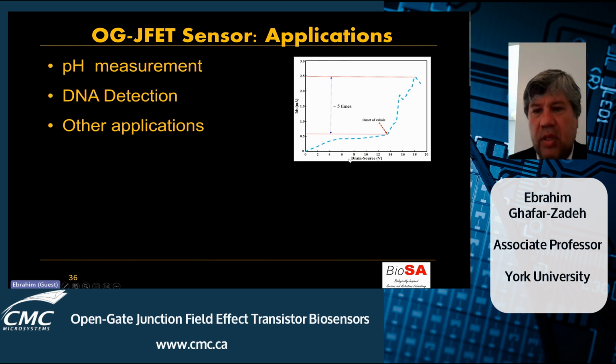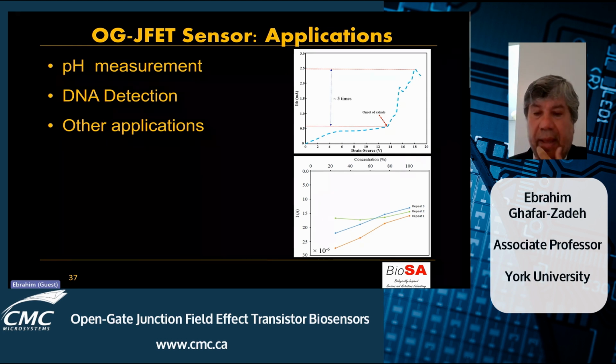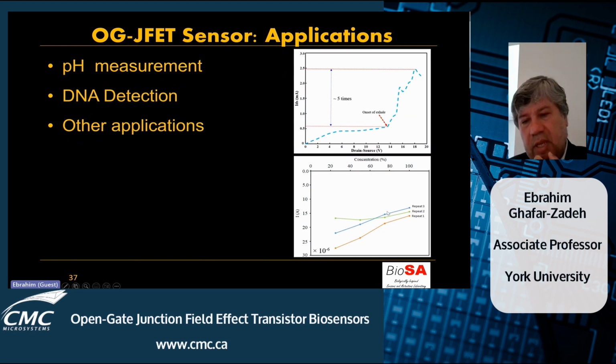So just two of these results. Here you can see that the presence of breathing air, which makes a very thin layer of liquid on the surface of the chip, results in a significant change of the current. Another diagram shows the repetition and the variation of the concentration of the oral cells in the liquid, in the ultra pure water. And that shows that for each one of these repeated measurements we can see the linearity. So the device was developed in general for different applications, and we use it for this as well.